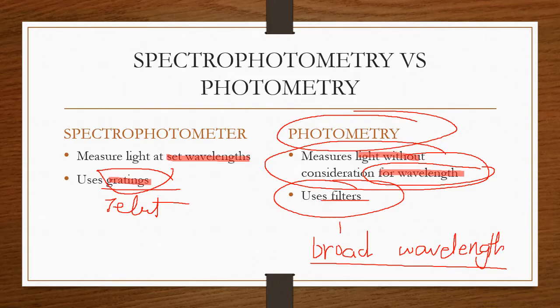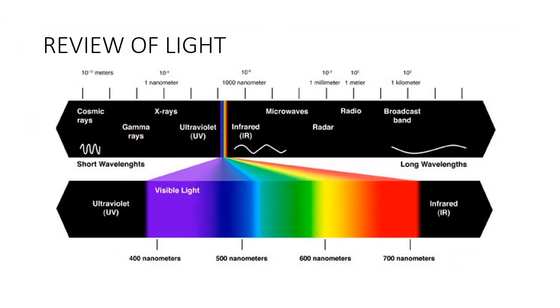Okay, so moving on. This is what I was referring to earlier as wavelengths. Wavelengths are measured in nanometers, shortened to nm. And here is the region we can see. This is called the visible light region. As you can see, it ranges from purple to red. Red is the largest or the longest in terms of wavelength, and purple or violet is the shortest.